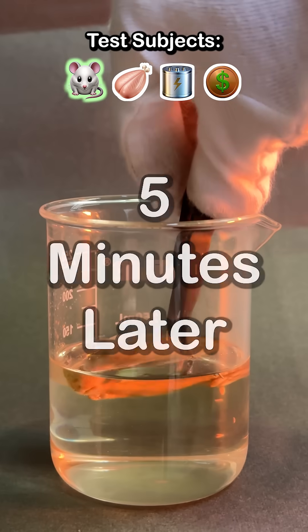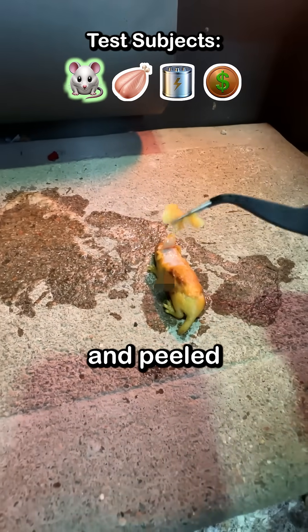Say bye-bye to red meat. Soon after it touched the acid, it started bleeding. The skin turned yellow and peeled like wet paper.